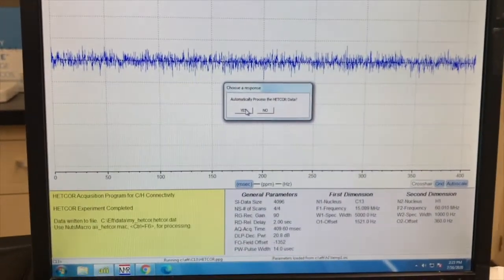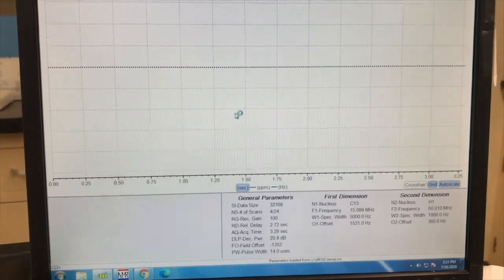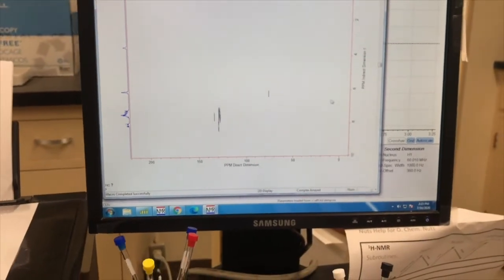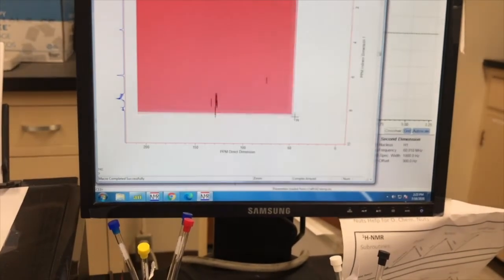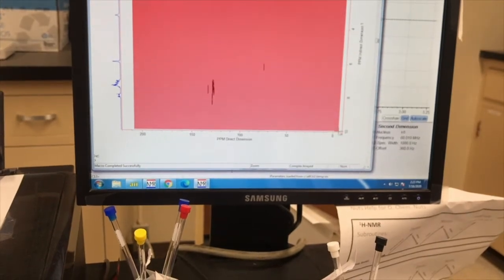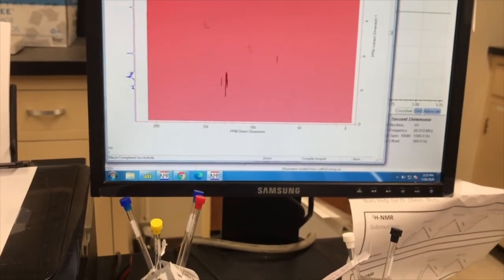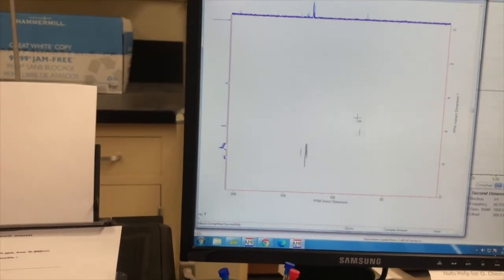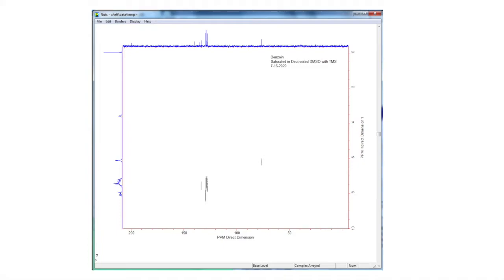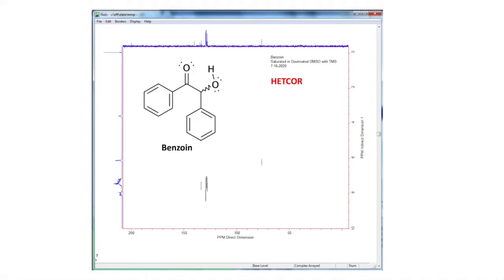My HETCOR scans are complete. It asks me if I want to automatically process the HETCOR — I do. Here it is; it looks pretty good. I'm going to zoom in on the carbon NMR from zero to a little past 200, and on the proton NMR from zero to about 10. Then I'll add a text box. Here's our HETCOR spectrum for the benzoin — putting the label down isn't covering up any signals.